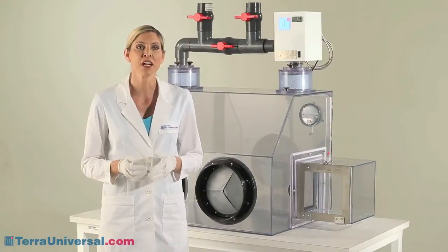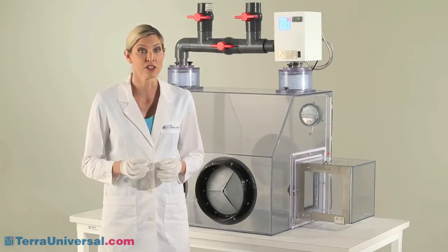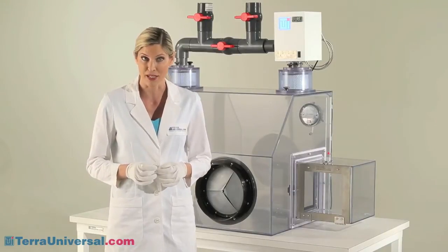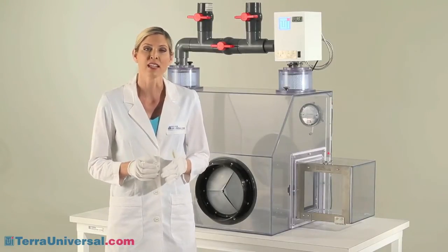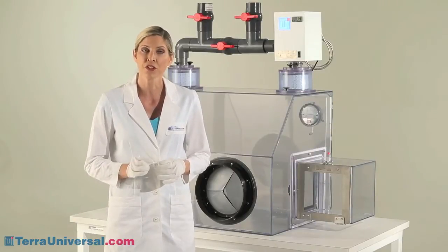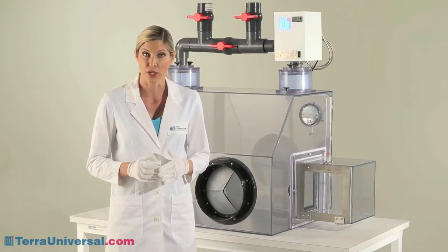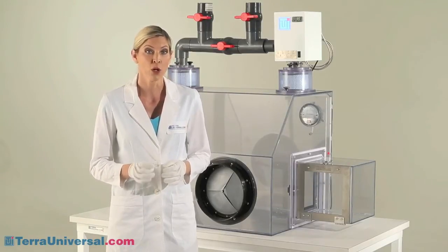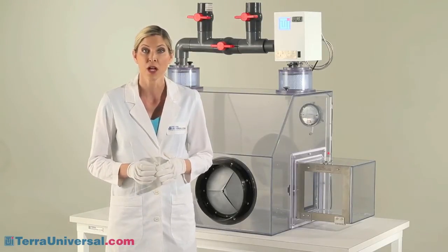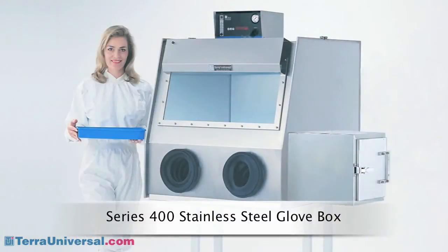Tera Universal manufactures a comprehensive line of glove boxes designed to meet diverse isolation and containment requirements. Versatile designs and a host of economical environmental control modules let you configure systems to regulate relative humidity, oxygen concentration, particulate and microbial contaminants, temperature, pressure, and electrostatic charges. These systems are available in over a dozen chamber designs.